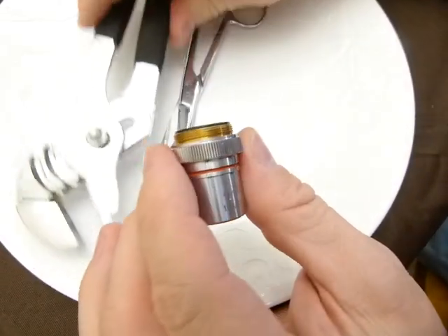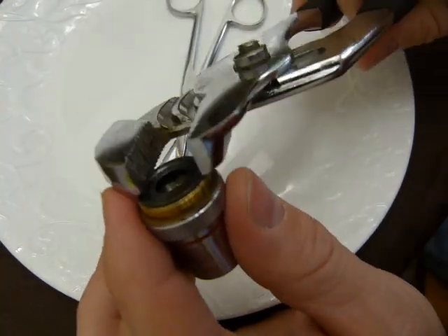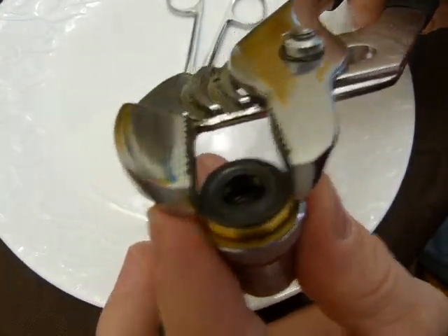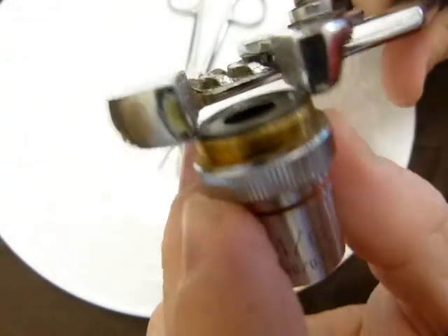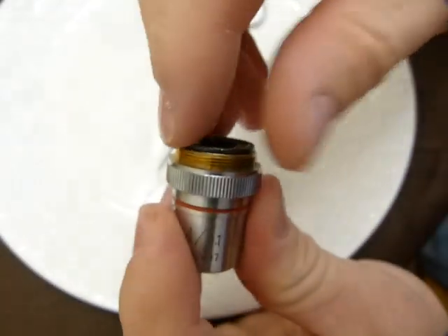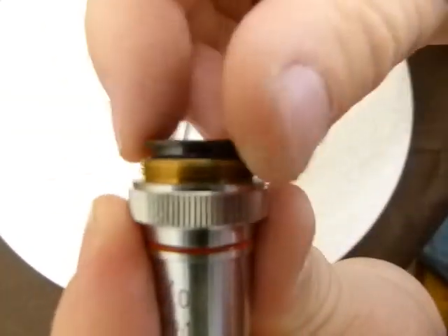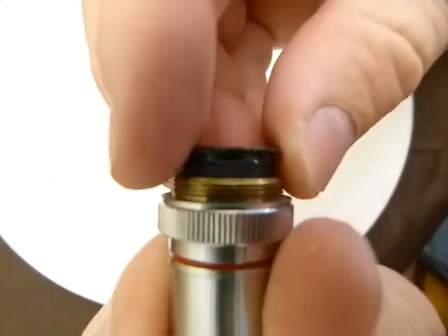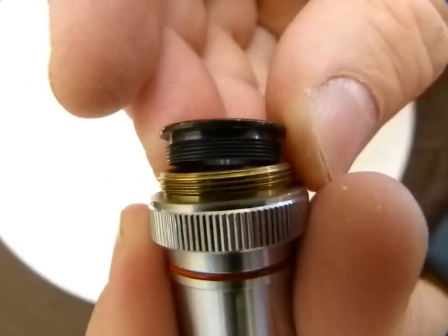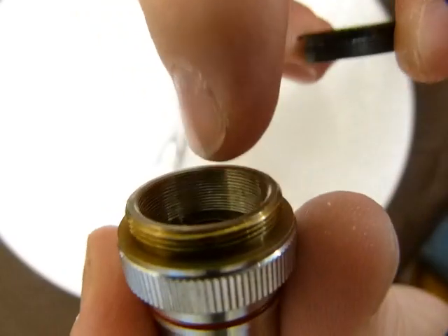What you need is a slip joint pliers like this, and with very little plier force you need to grab this black ring up here. It's threaded, so this one just comes out like so. Super straightforward. You can see that the thread is very fine on this black ring.